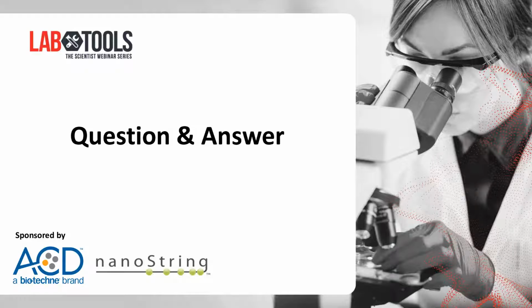All right, thank you very much. For our next question, going back to Kit again: for DSP, for detecting protein levels, do the oligo-conjugated antibodies have to be commercialized? Or can you use custom antibodies from somewhere else, or maybe homebrewed or something like that?